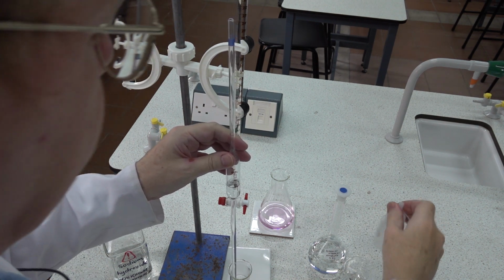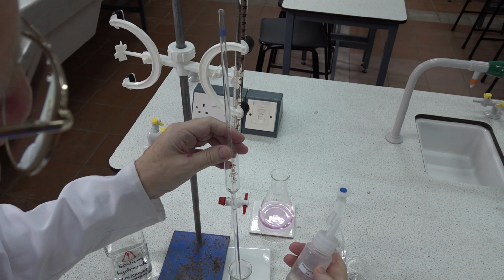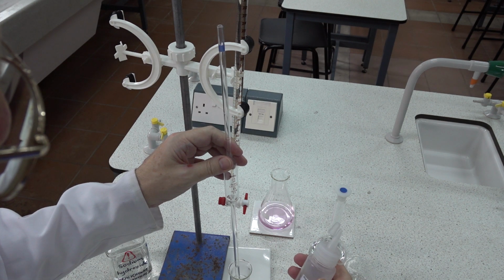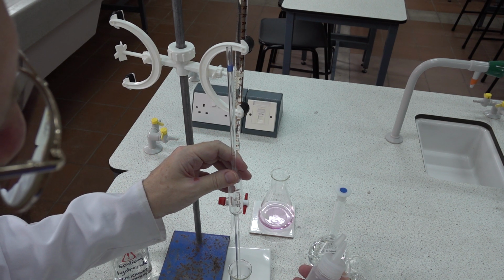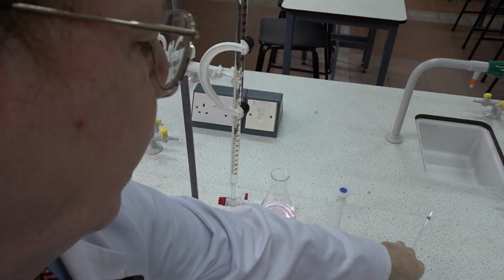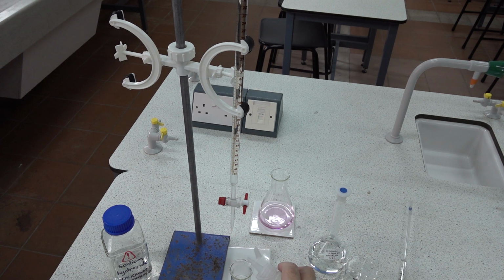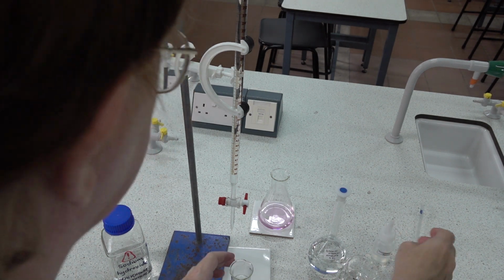While that's running out, we can prepare our indicator. We're going to be using phenolphthalein. This is colourless in acidic solutions and will turn pink in alkali when we've added enough sodium hydroxide to react with the potassium hydrogen phthalate acid. So we add 2 to 3 drops. Here we go, 1, 2, 3. And we're now ready to proceed with our titration.